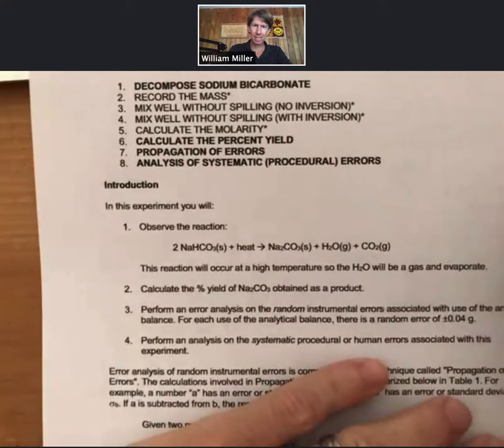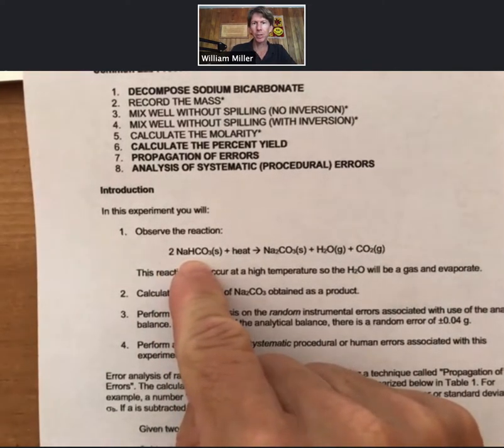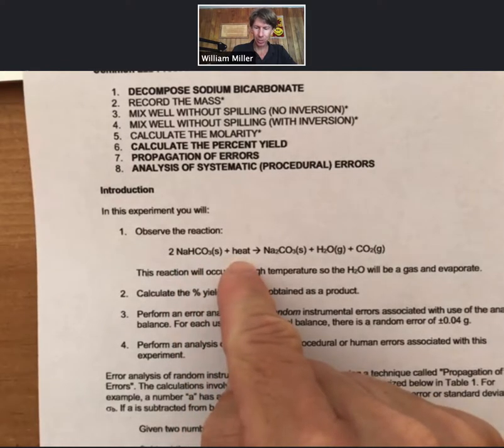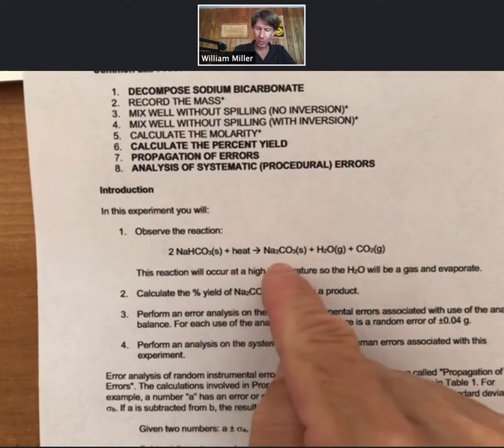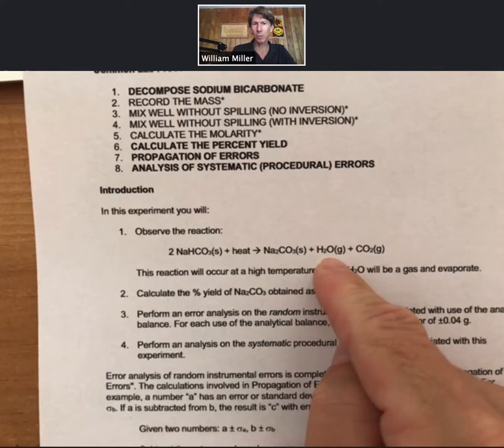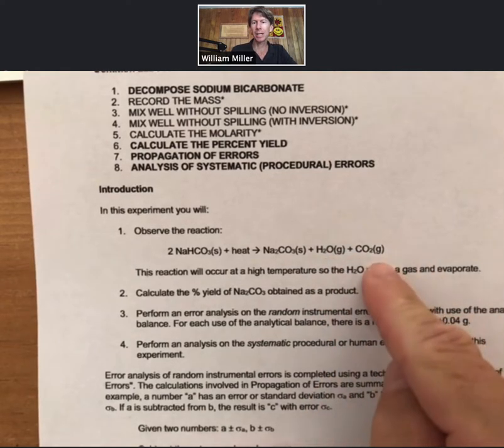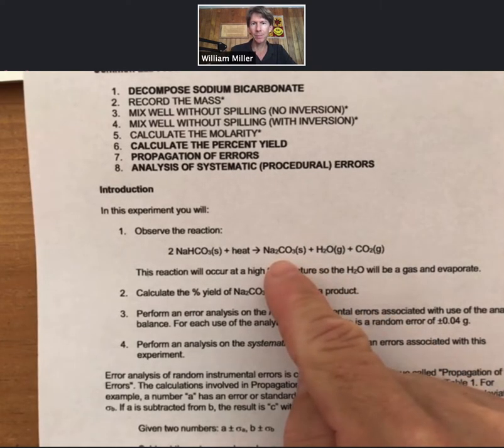Not a whole lot to say here, except that we're going to be starting with sodium bicarbonate. We're going to be adding heat from our oven. The product is going to be sodium carbonate. When this reaction occurs, it will also produce H2O gas — water vapor — and carbon dioxide gas. Those will go into your oven, and you'll be left with sodium carbonate as a product.